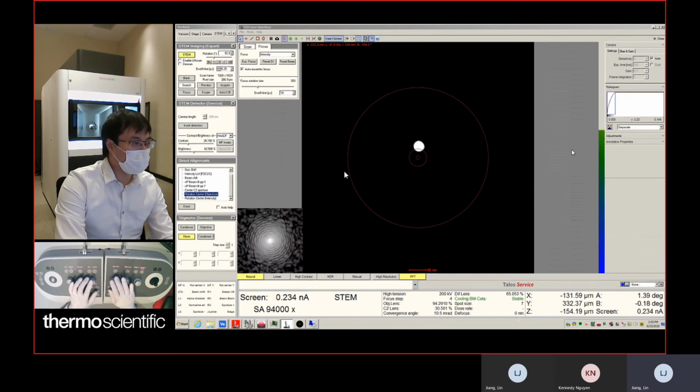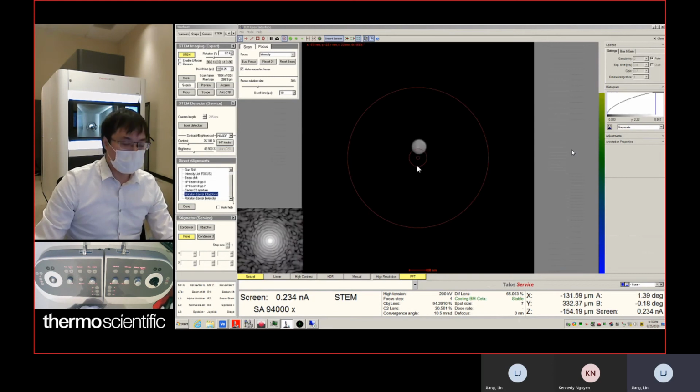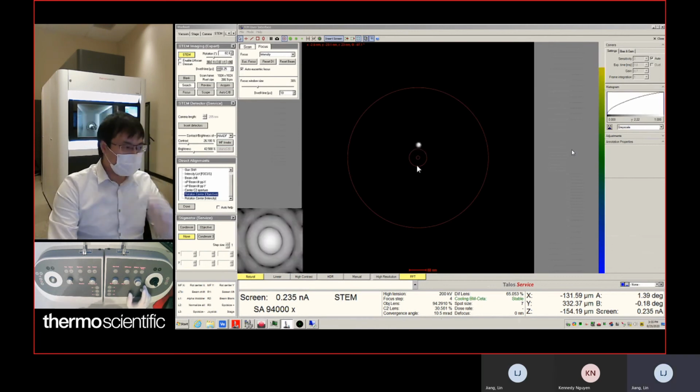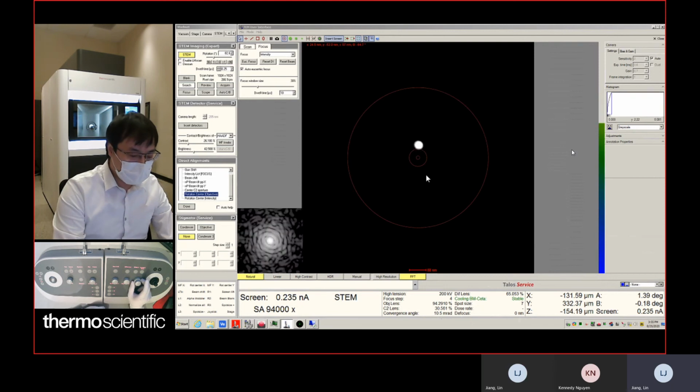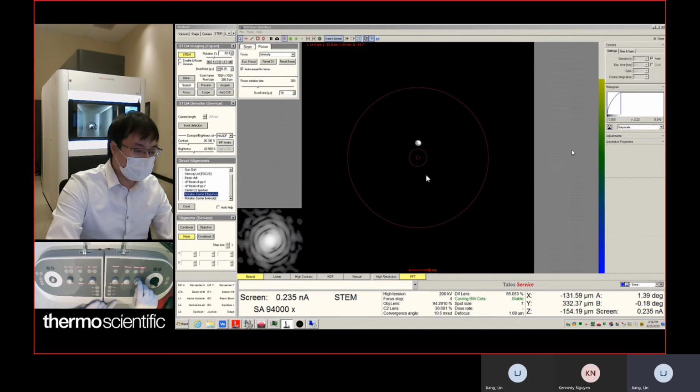It's close. Another thing we can do, so we should say this, I found this is very hard to do. So usually for me, I just use the focus lock here, use the outer ring to stop the wobbling. If you go counterclockwise, adjust the stop sign, it's going to stop the wobbling. And then you use the focus to zoom out or zoom in the beam a little bit.